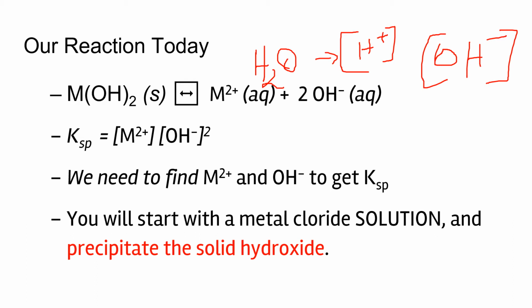And therefore with our experiment we are going to use the KSP concept where we have a starting concentration using a chloride solution, and then use the sodium hydroxide as the source of our hydroxide. And once we obtain our slightly soluble metal hydroxide, we will continue adding some of the hydroxide ions into this solution.